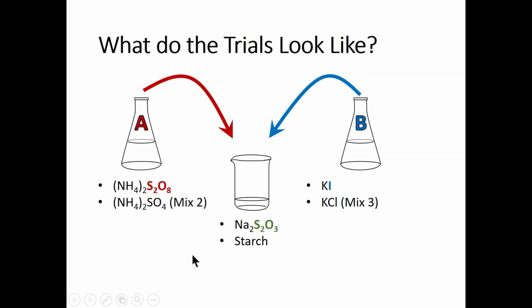And you'll run a trial with that. So in the next trial, you'll be cutting the concentration of S2O8 and looking at how that would affect the speed of the reaction. What did it do in response? Did it affect the speed? You'll look for the blue color, and you'll take down the second data point.